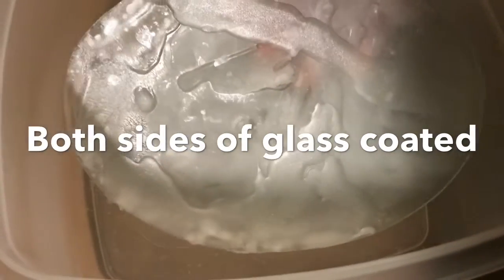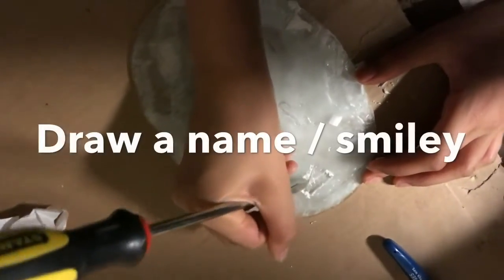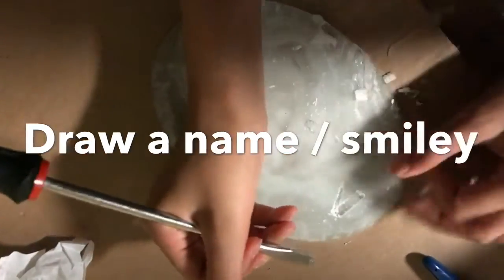Next step is to write some letters into the glass and see if we can etch it with hydrofluoric acid. This step can be difficult as the wax tends to crumble.